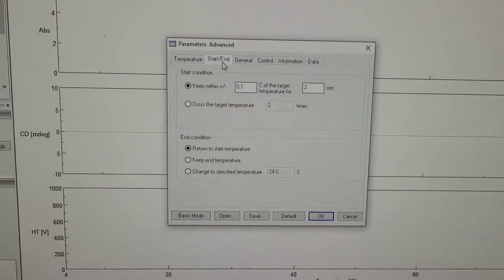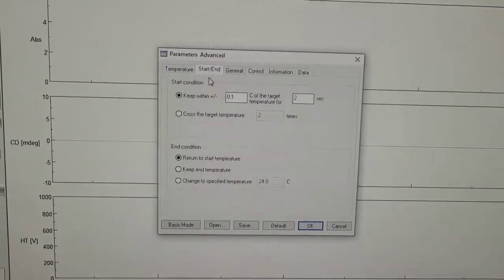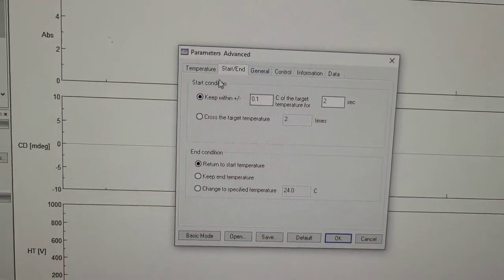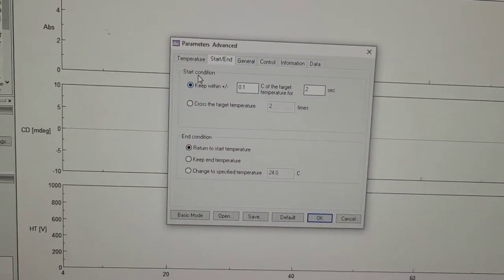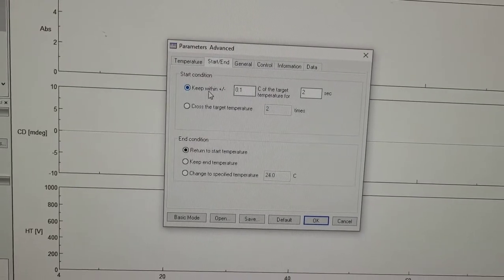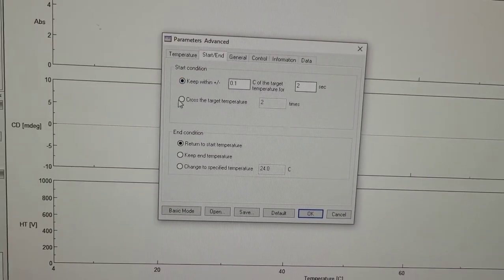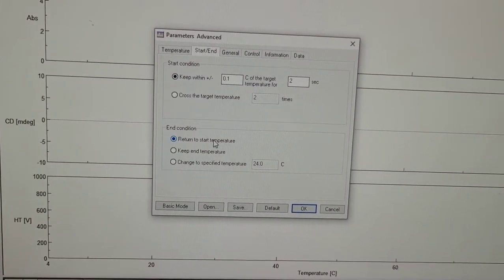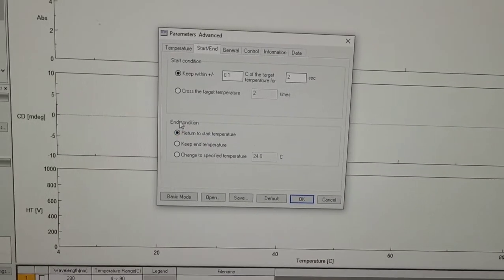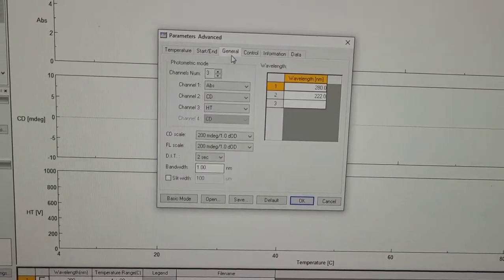Then you want to go to the next window. So start condition, these are all good. Return to start temperature after it's finished, yes.